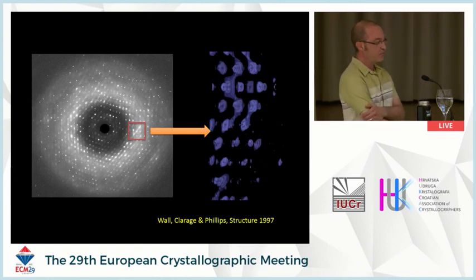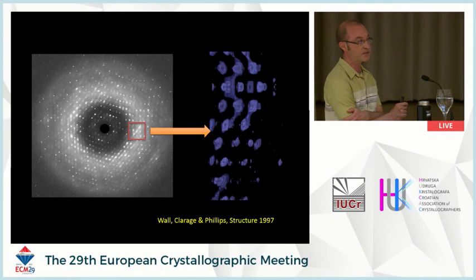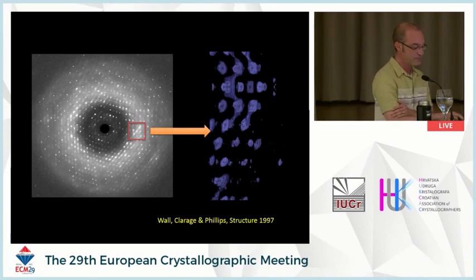Then we applied these to calmodulin and looked at both the large-scale features, and here I'm showing integration of features in the neighborhood of this streaked feature seen in this image. You can do sampling on a finer scale than the Bragg lattice. Sometimes this is called a Gibbs lattice, or at least that's what we called it in George Phillips's lab.